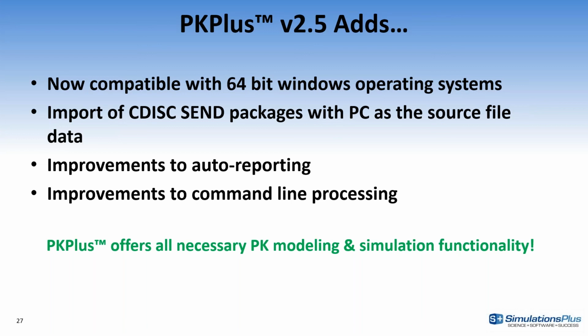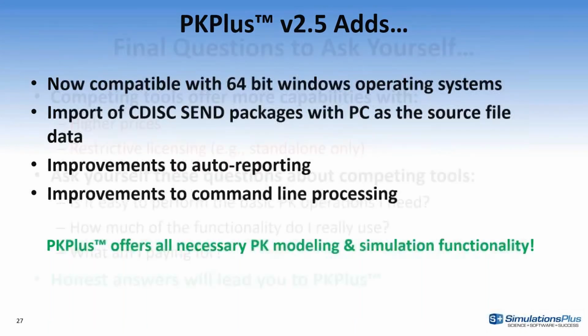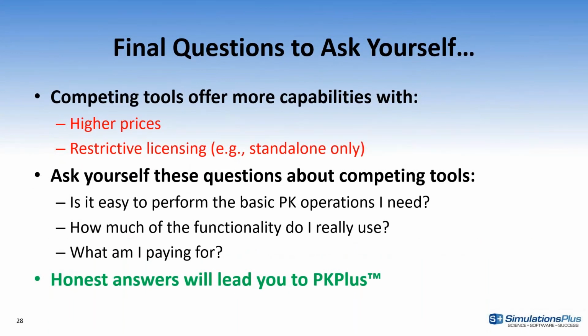Some differences in the operating system, some bug fixes, and really, we're trying to make sure that, once you get the PKPlus version 2.5 in your hands, you're going to be off and running very quickly. So there's a few final questions to ask yourself.